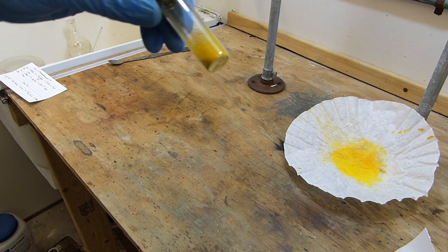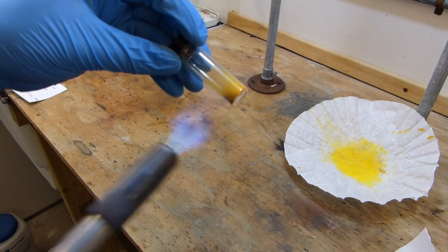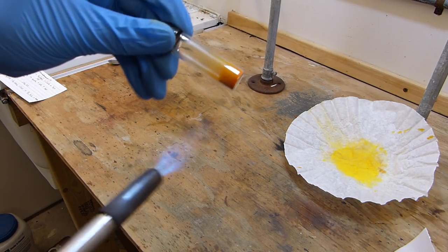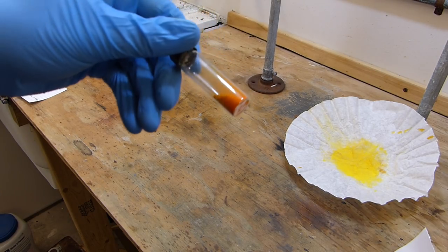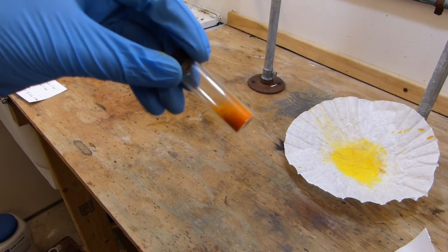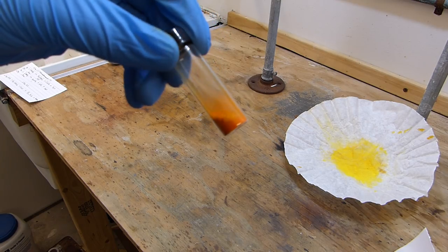We can do the same thing with this little vial here. It's bright yellow. I'll just play the torch flame on it very carefully and you can see it's turning orange already. A little bit more heat, continuing to go orange, a little bit more, and it's almost completely bright orange now.